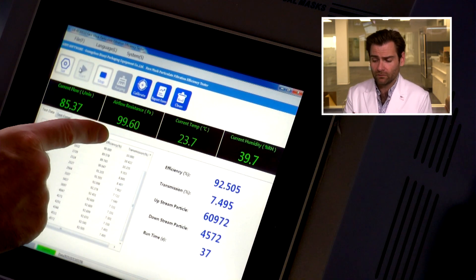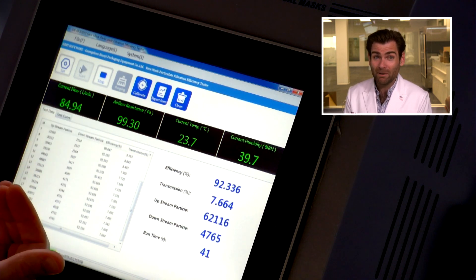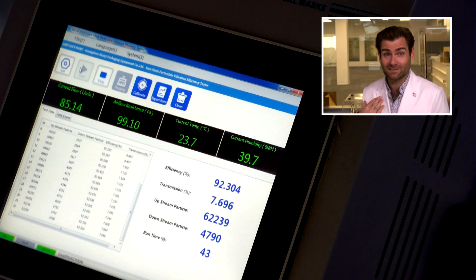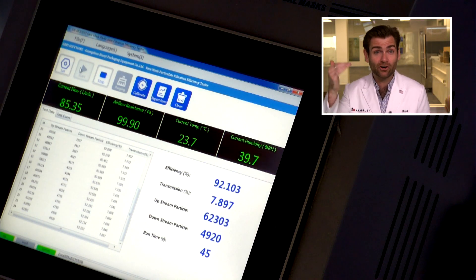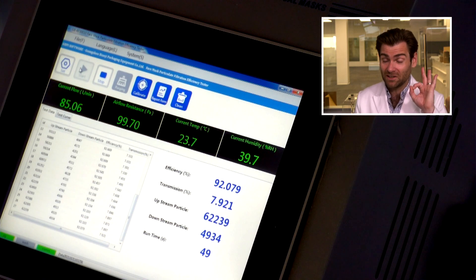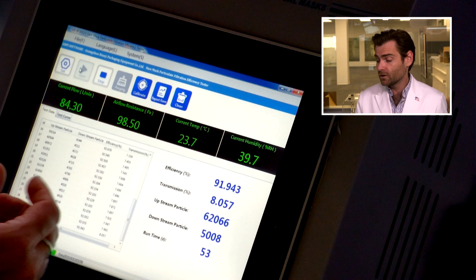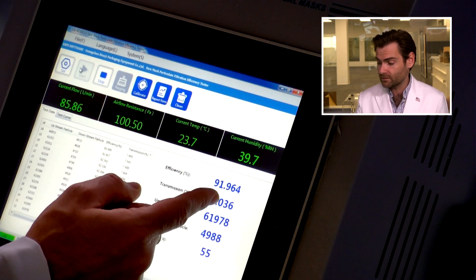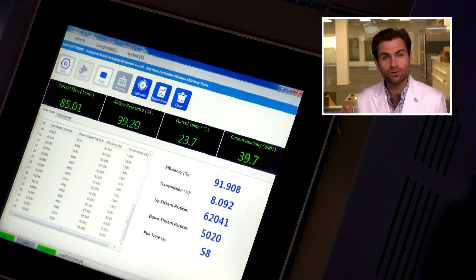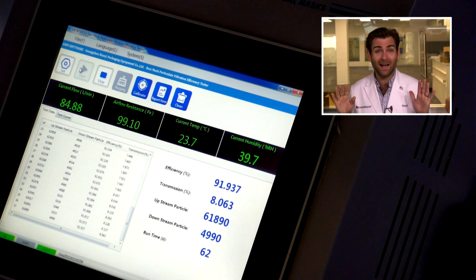Let's take a look at how the mask is doing. The airflow resistance is pretty good for the amount of air I'm pushing through — it's under 100 pascals. That's better than our masks, to be honest. We want to see under 150 pascals, and this is under 100, so the breathability on this is really good. Breathability does typically follow filtration.